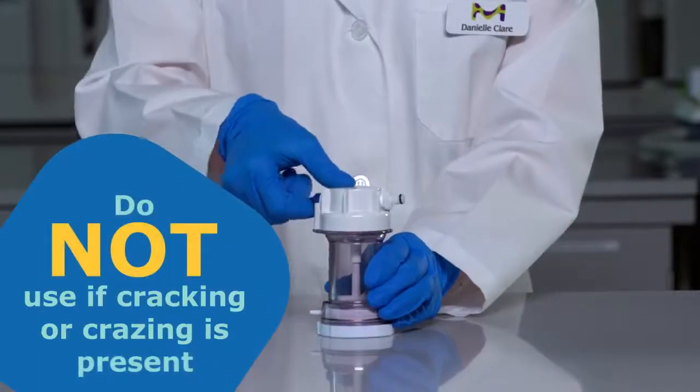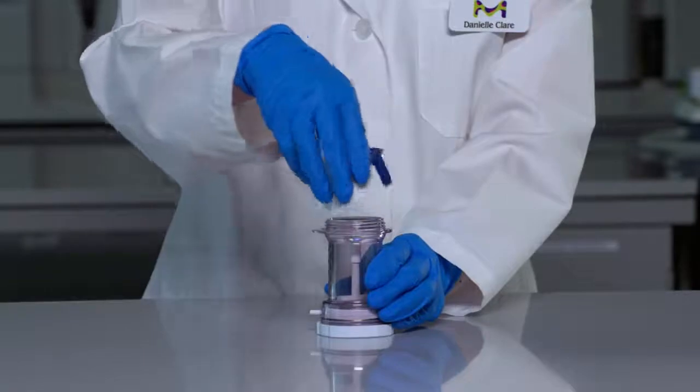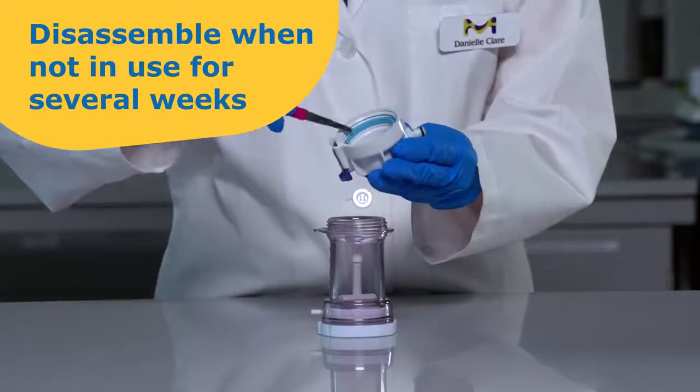Don't use the stirred cell if the body has suffered any damage like cracking or crazing. Disassemble the stirred cell when it is unlikely to be used for several weeks.